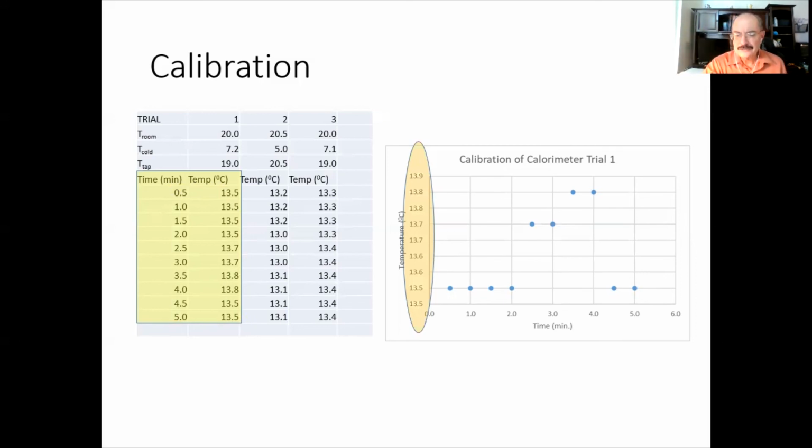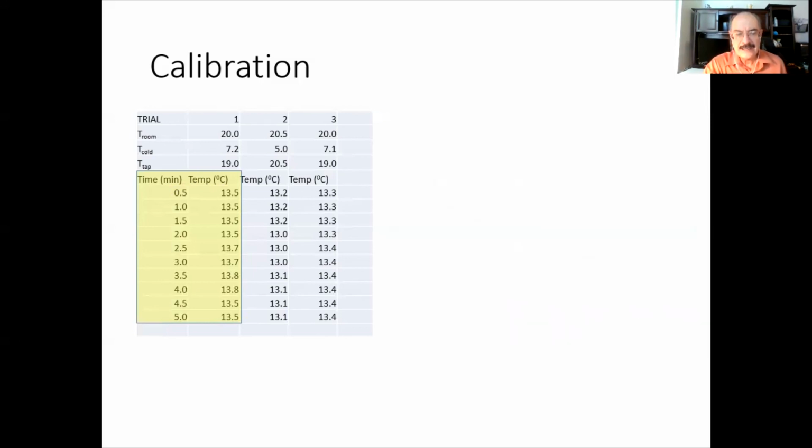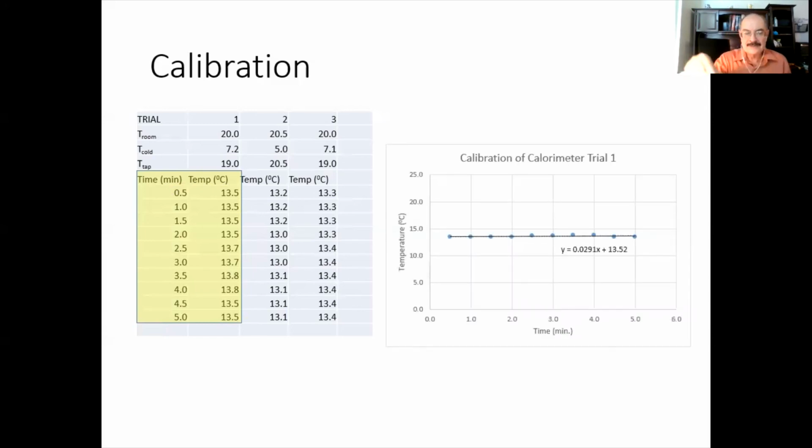So what we want to do is we want to fix this. And please, you can go to our graphing activity the first week, or you can use the help menu in Excel and learn how to take that y-axis and change it to a range that's more reasonable. We're looking at temperatures that are in the low single digits to the 20-something degrees. So I'm going to go in and change this y-axis to a 0 to 25 range. And now my graph looks so much better, right?